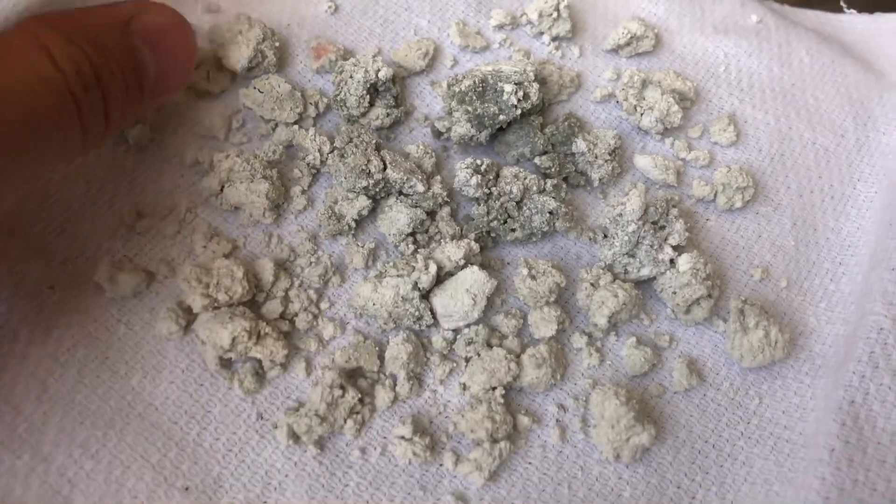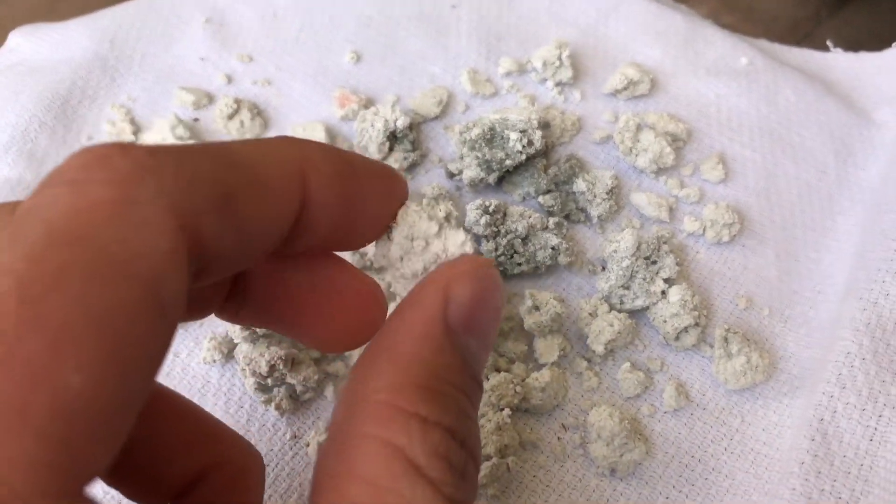To actually show you that we made silica gel, I dried it in a vacuum over anhydrous calcium chloride. Silica gel should keep at least some water in it, and we can prove that by heating it up.